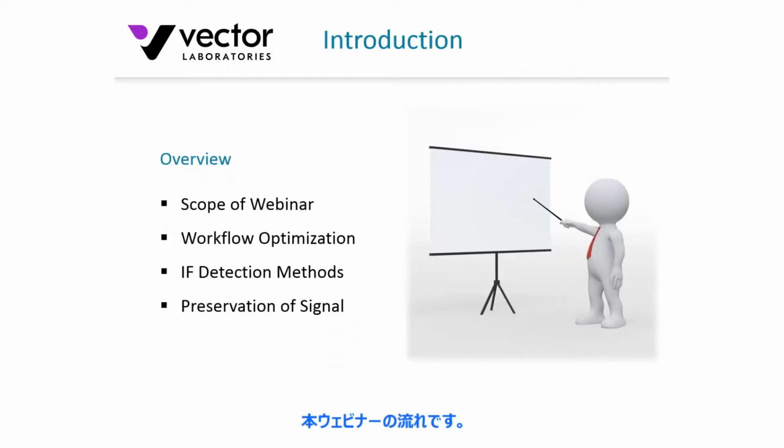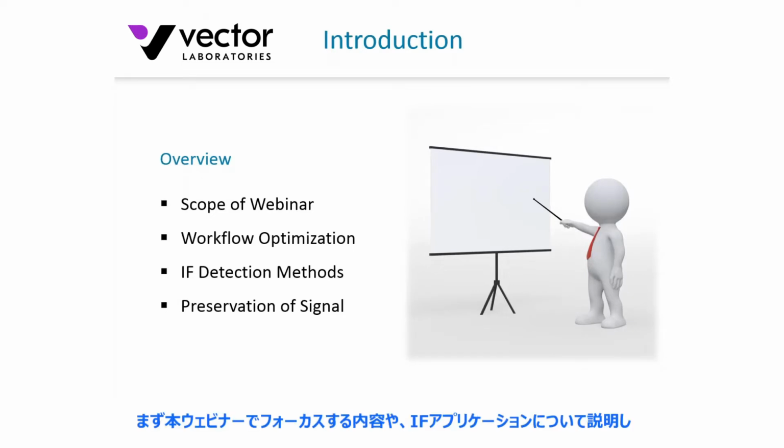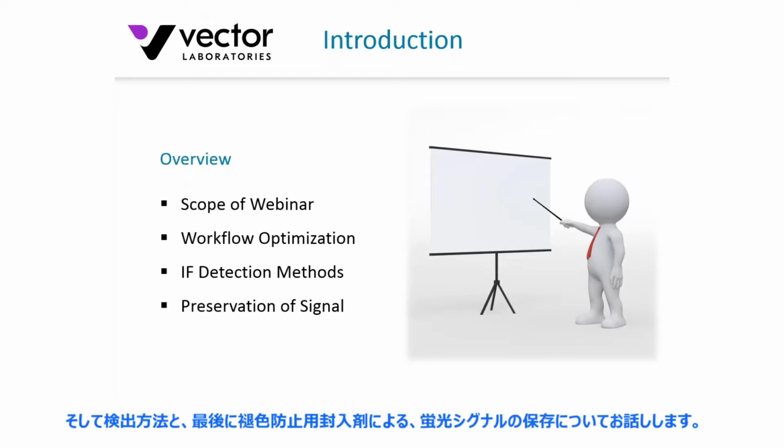Here is a brief overview of the webinar we'll be presenting today. We'll give you an idea of the scope of the webinar, the specific immunofluorescent application we'll be describing and discussing, and then we'll get into optimizing and maximizing conditions to retain the signal to certainly give you the best result at the end of the day. We'll look at detection methodology and preservation of signal, which will be a discussion on anti-fade mounting media.